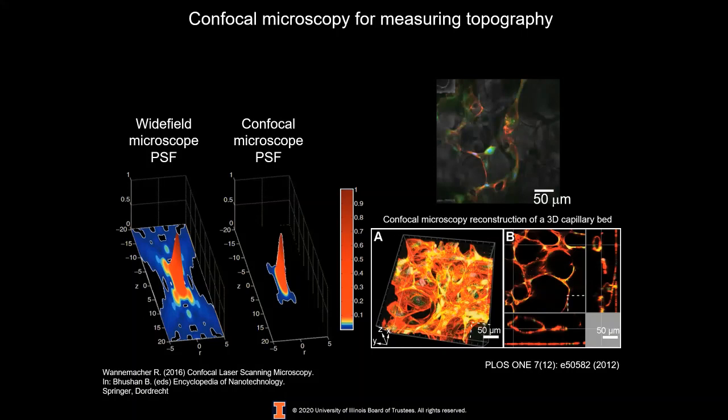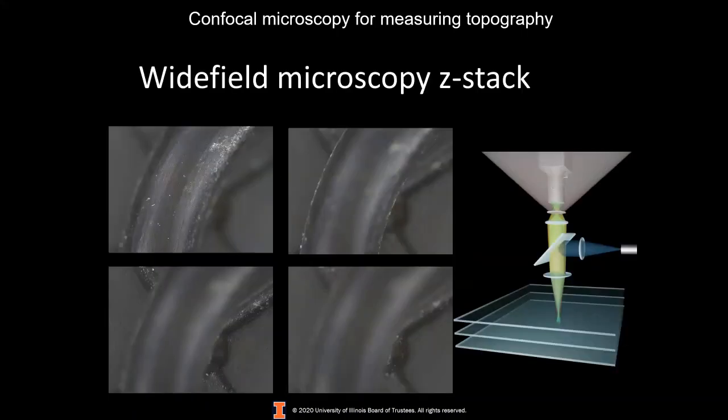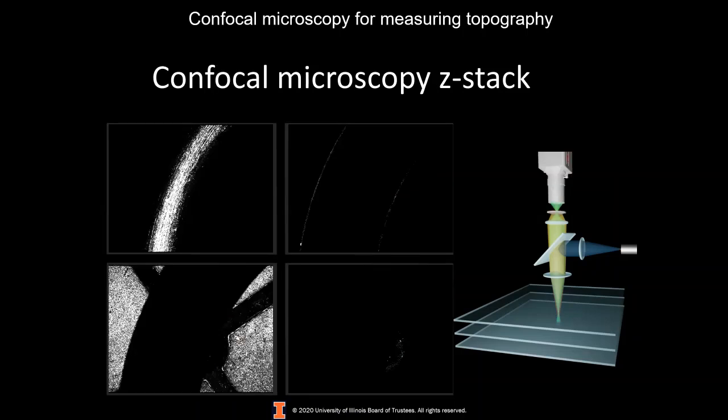In the case of focus variation, due to the noise added by the out of focus light, it is necessary to detect what is the best position for the focus of each of the pixels in the image. In the case of the confocal microscope, only the light from a very shallow in-focus volume from the sample makes it into the detector. And then we can just monitor the intensity of each of the voxels of the image across the Z-stack to form the topographic image of our sample.